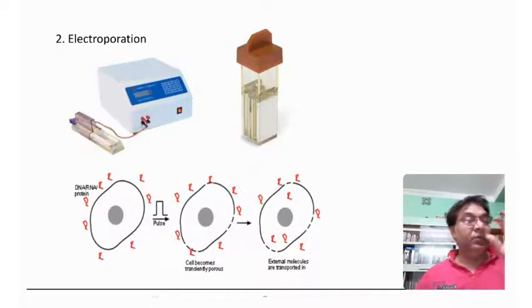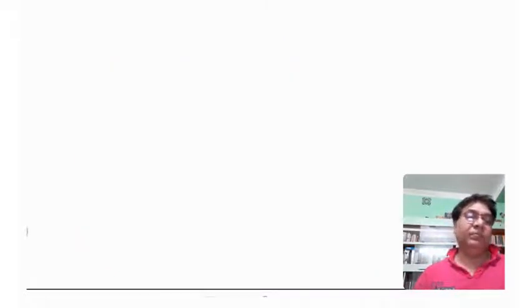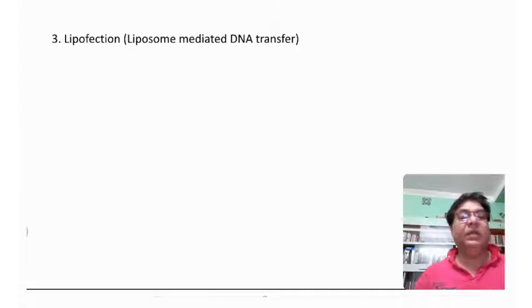Your cells take the DNA inside. So this is a very beautiful method. This is a physical method of DNA transfer. After the shock, the cells must be revived, as was also the case in the calcium chloride method.